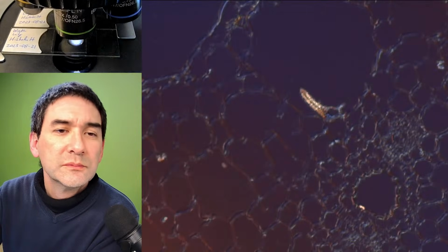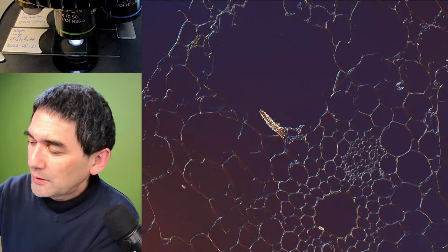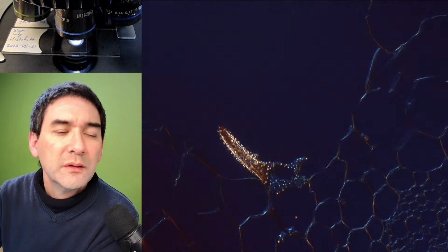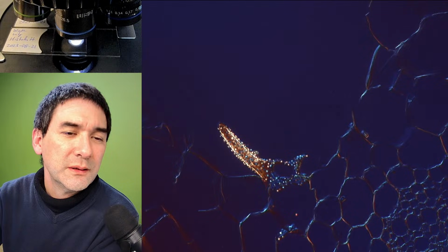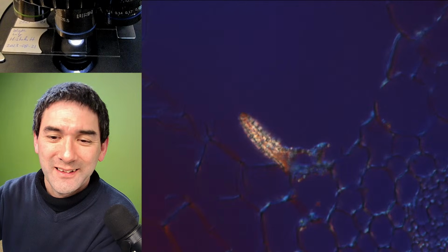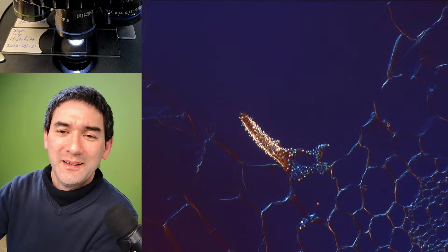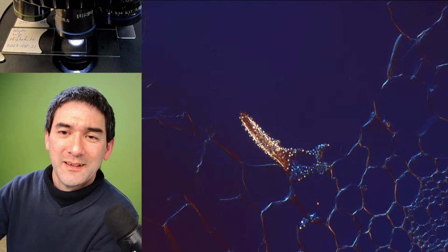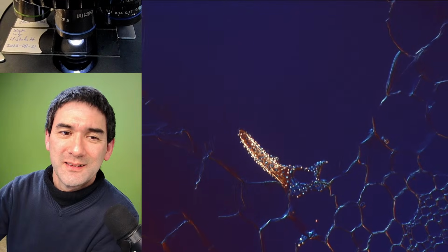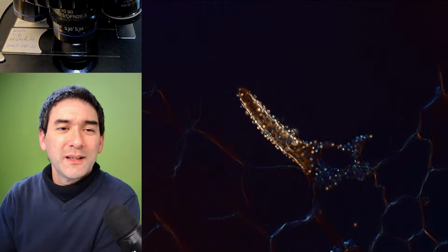Right in the middle. Yep. Here we go. Yeah, they really start to shine. So here we go. Let me see. Can I go up yet further? Yeah. This is kind of nice.